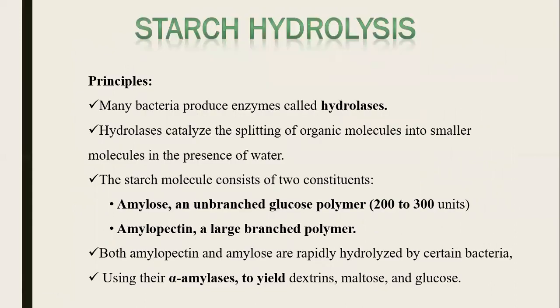Next, starch hydrolysis test. Starch hydrolysis test is to determine the ability of bacteria to hydrolyze starch. Bacteria which have hydrolase enzyme will hydrolyze the starch into oligosaccharides and monosaccharides. It splits the polysaccharide starch into smaller molecules in the presence of water.